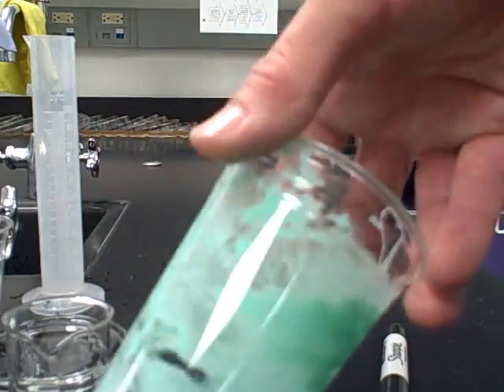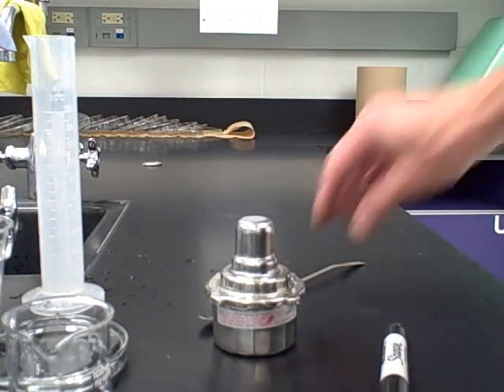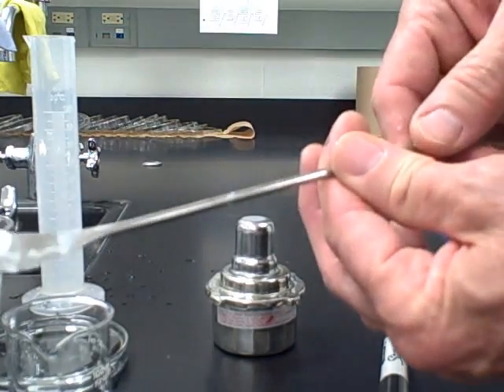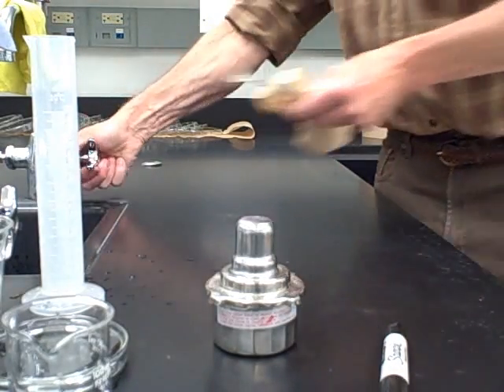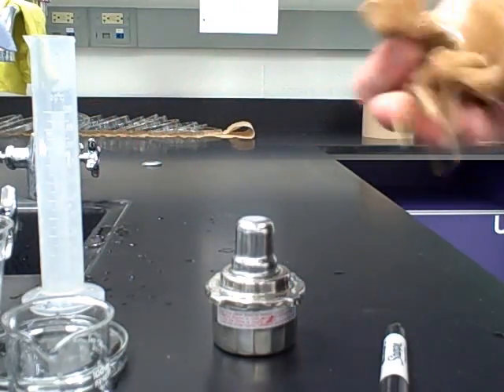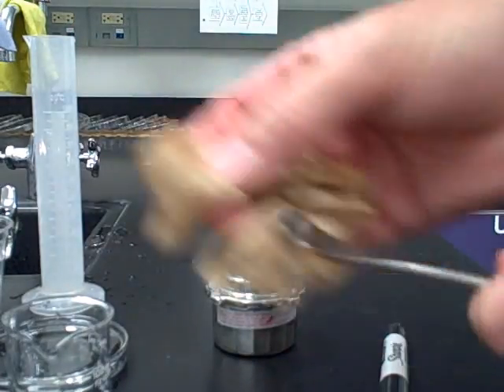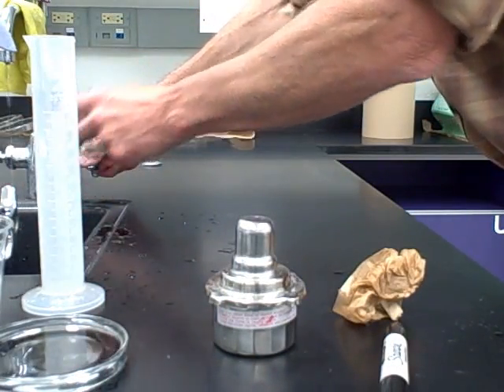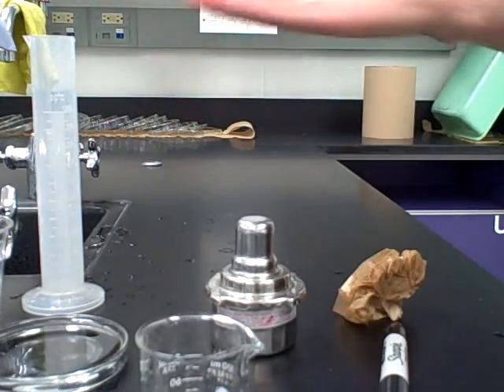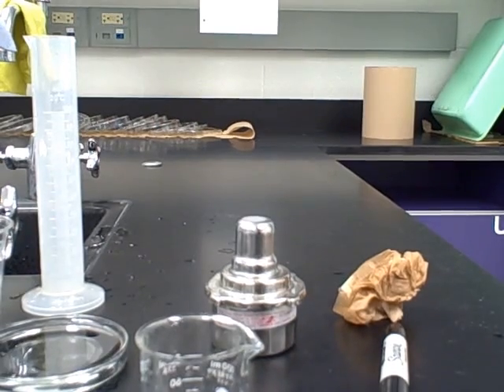For cleanup: the cup is a disaster, so just discard it — we'll never get it clean. Take the micro spatula and use a moist paper towel to get all of the amorphous solid glue mixture off of it. Rinse out the beaker to get the residue of the borax solution out, then put everything back nice and neat as the picture shows you, and have a seat. Good luck.